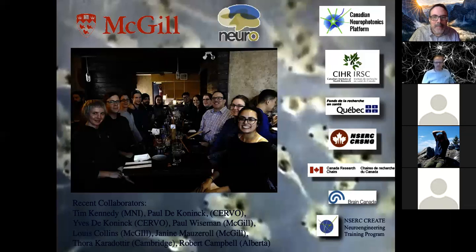I'm still skeptical. Of course, Valerie made a nice effort, she's trying to make it work, but I'm not sure whether it'll be all that useful for zebrafish imaging, to be honest. I guess it's a question of temporal resolution. Is that the problem? But even the signal, I don't know, she hasn't collected enough data. It's still early on. This project has been sort of difficult on the technical side, and it's extremely slow. So to be honest, I don't really know.